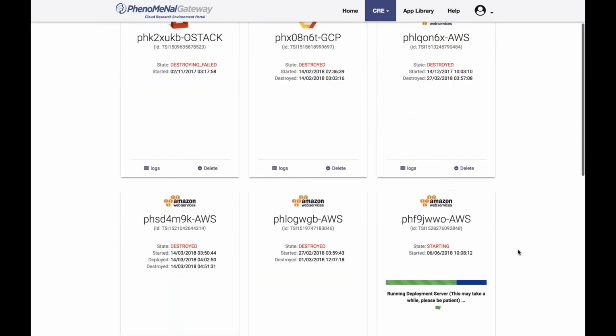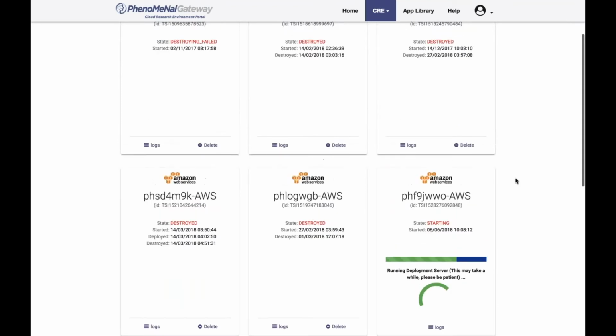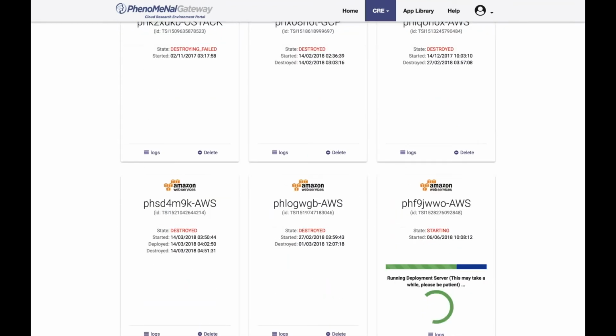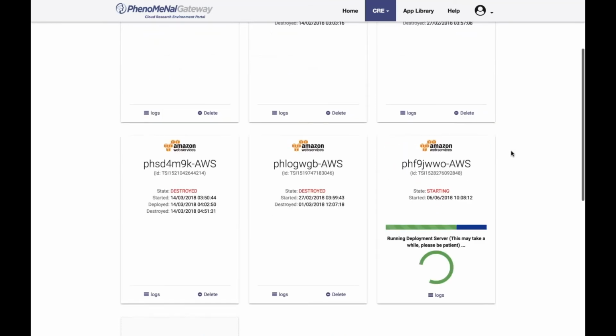So in the meantime, while I leave this running, I will go back to the setup where I can create my account on the PhenoMeNal Cloud Research environment.